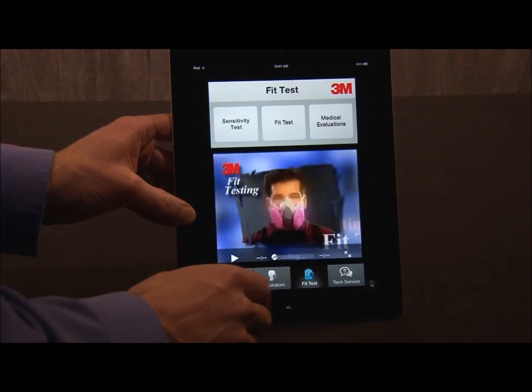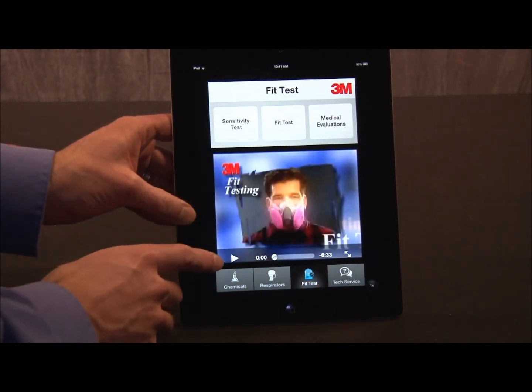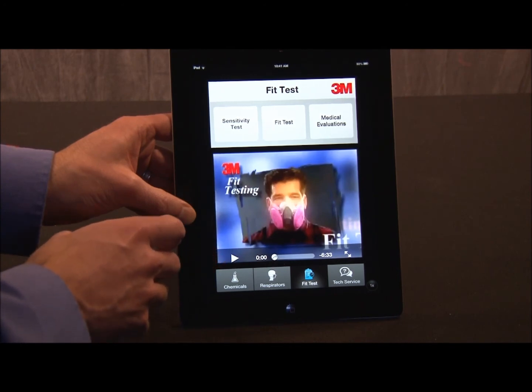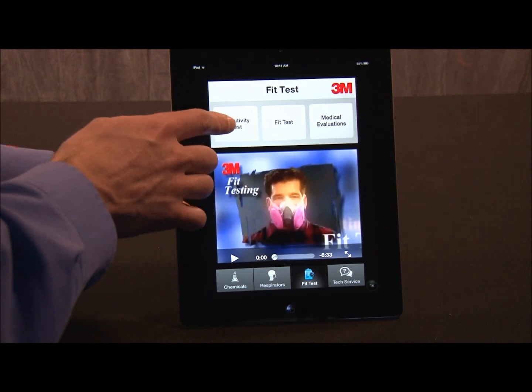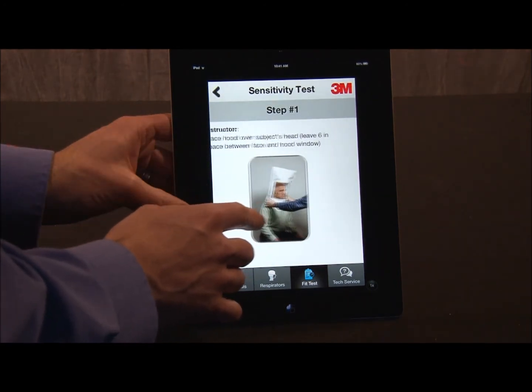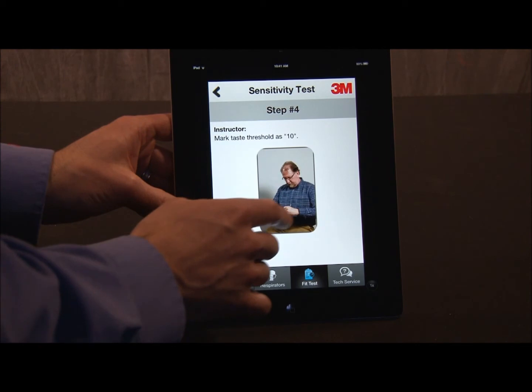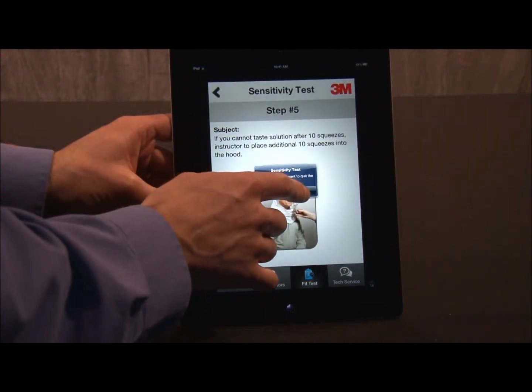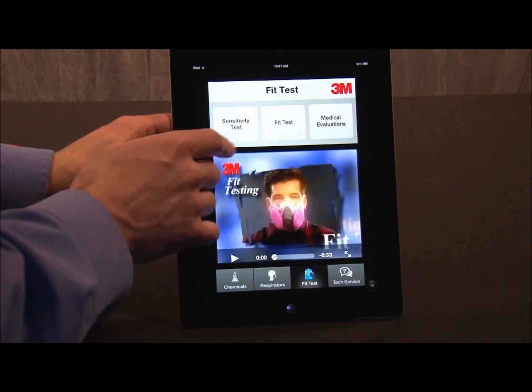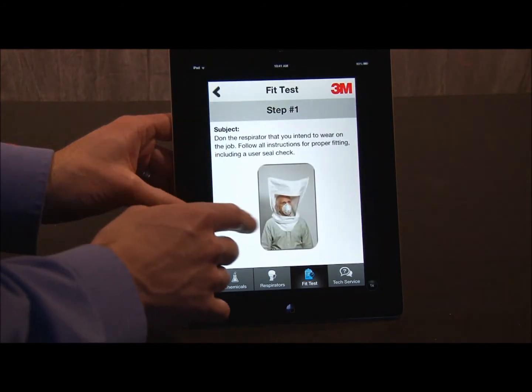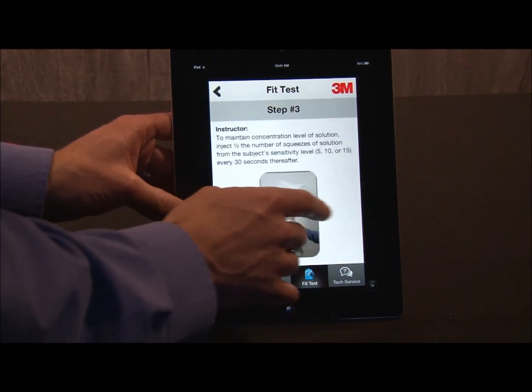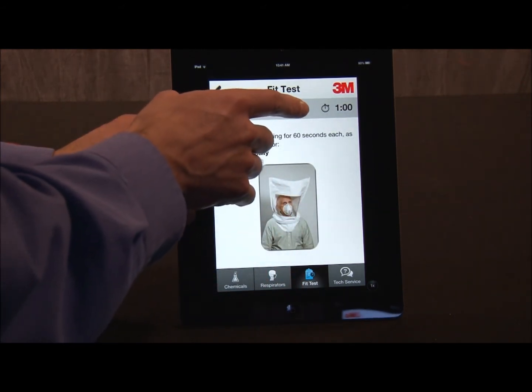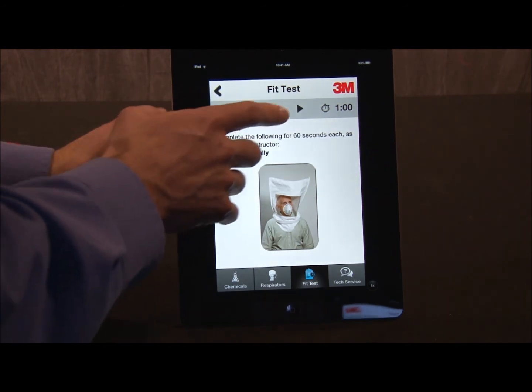Next, I can go to the Fit Testing section. If I want, I can play a video about fit testing, or I can look at the individual steps — for example, the sensitivity test. Here are the different steps to performing the sensitivity test. Next is the fit test itself — go through the different steps. In some of these exercises, there's a timer for each one-minute exercise, so I can hit the arrow button to start the timer.